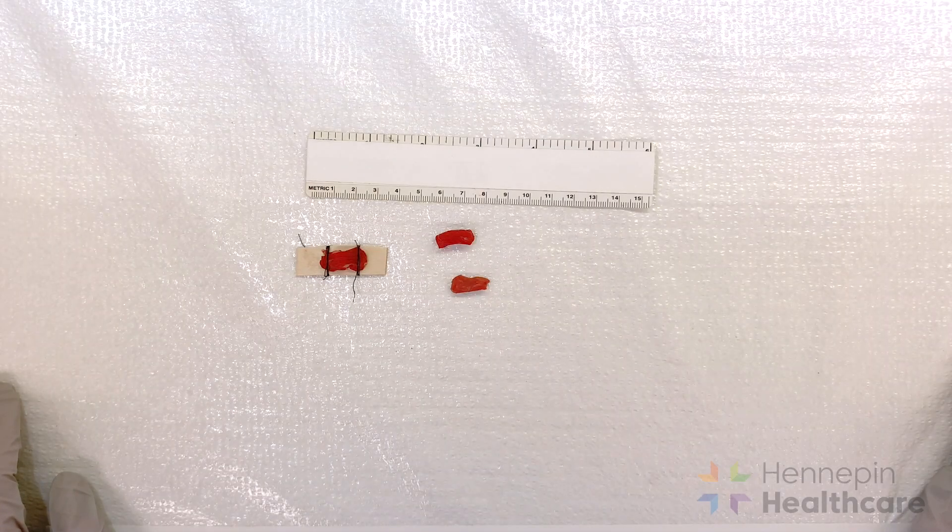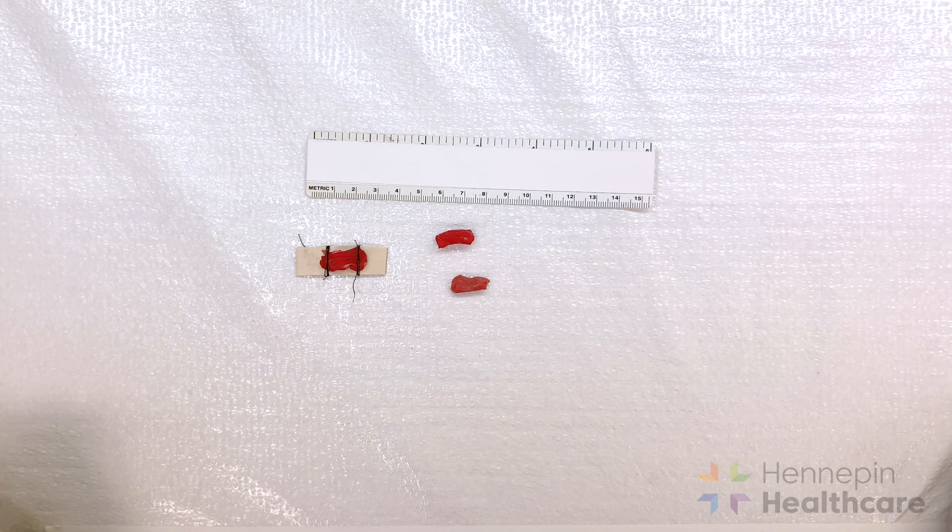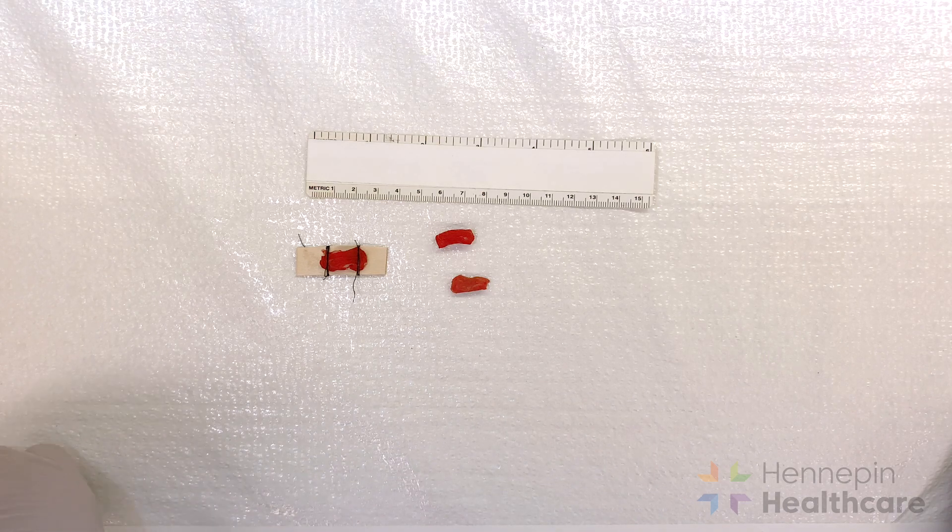When we evaluate a muscle biopsy, it's important to not only have sufficient tissue but to also have tissue that has been handled properly to preserve the tissue architecture and to avoid the introduction of artifact. Muscle biopsies should consist of three pieces roughly 8 to 10 millimeters in diameter — roughly the width of a pencil eraser — by at least 10 millimeters in length.